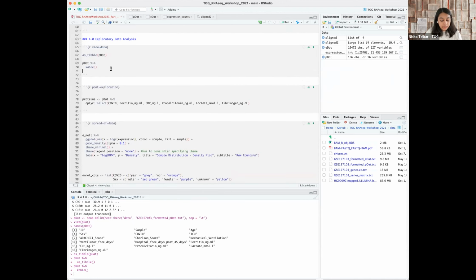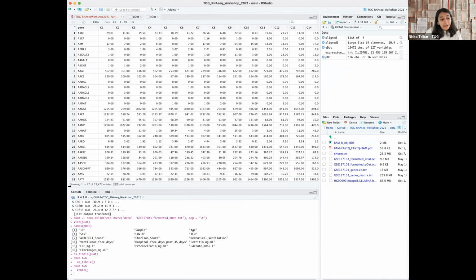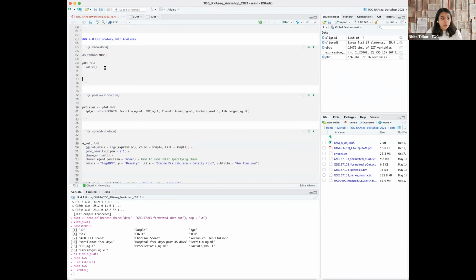What we're now going to do is, like I said, in our expression data frame, we have this one column which has all the names of the genes. However, when doing analyses, you need to convert it into row names, because some of the functions only want your numerics and they don't want any character formatting. If it's present, the code or the function will not run.